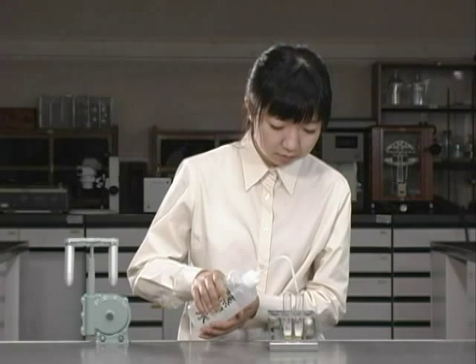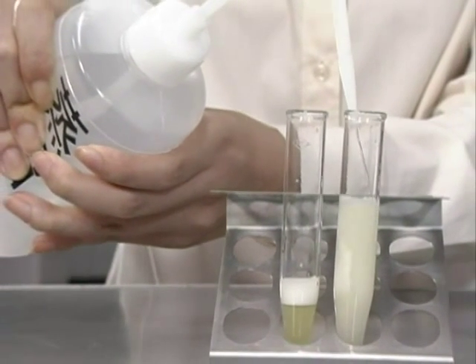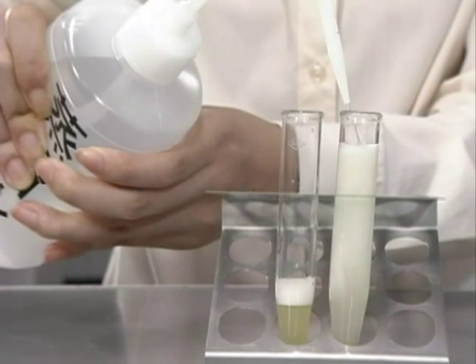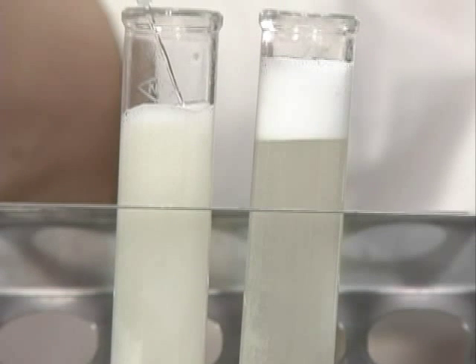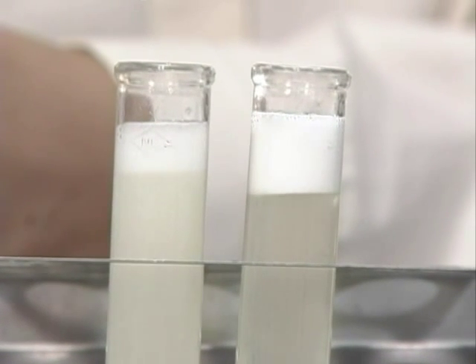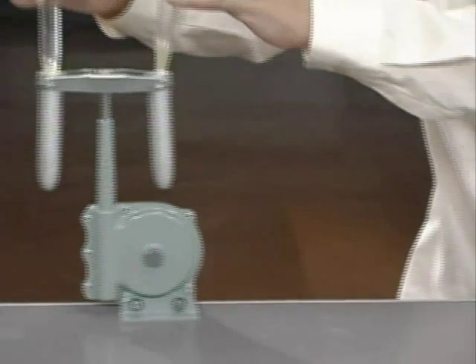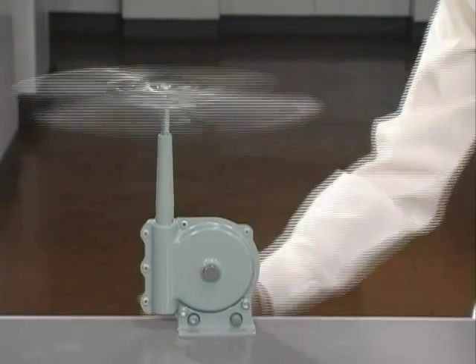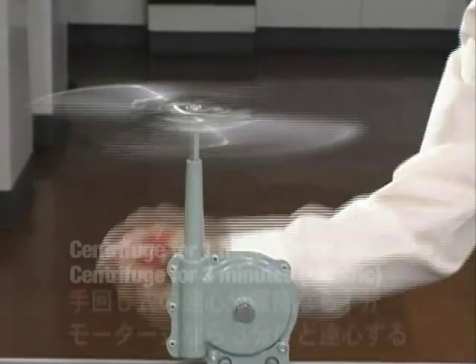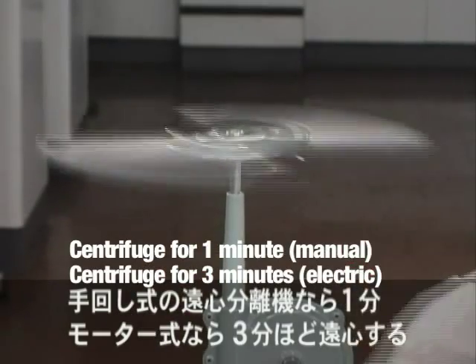After waiting 20 minutes, the mixture is diluted using distilled water. The amount of liquid in the two centrifuge tubes is made equal with the addition of the water. Next, the tubes are placed in a centrifuge, where the diatoms are precipitated from the mixture. Both motorized and manual centrifuges are appropriate to use.